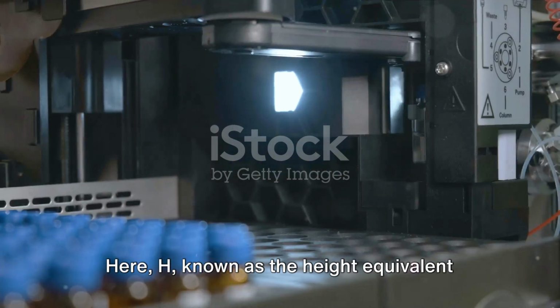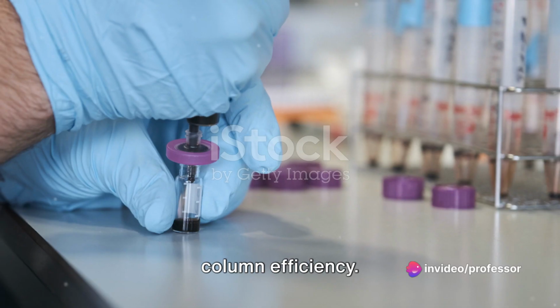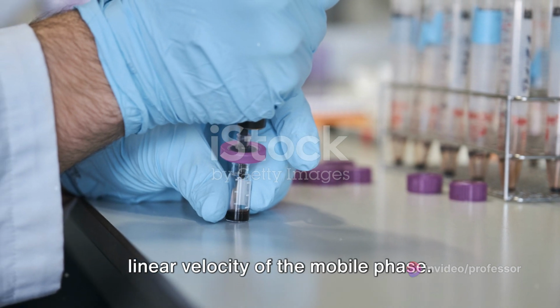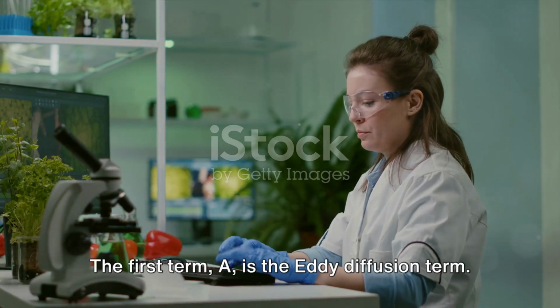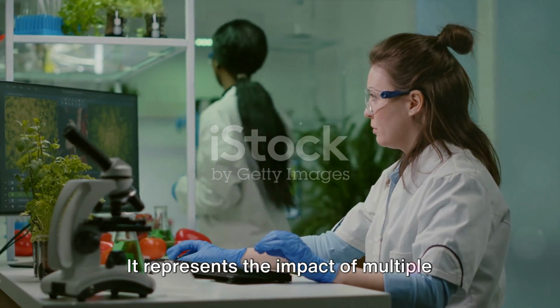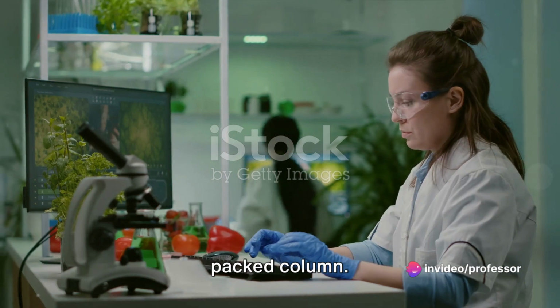Here, H, known as the height equivalent to a theoretical plate, is a measure of column efficiency. A, B, and C are constants, and U is the linear velocity of the mobile phase. The first term, A, is the eddy diffusion term. It represents the impact of multiple paths that molecules can take through the packed column.